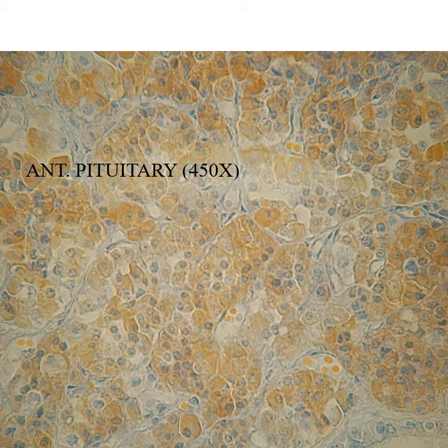The problem with the differential staining is it is species specific. You see three different colors in there. You see some kind of blue cells, some clear cells, and some reddish stained cells. There are acidophils, basophils, and chromophobes, but don't worry about it too much. Again, it's species specific, and I don't even know what species this slide is from, so I typically don't use it.